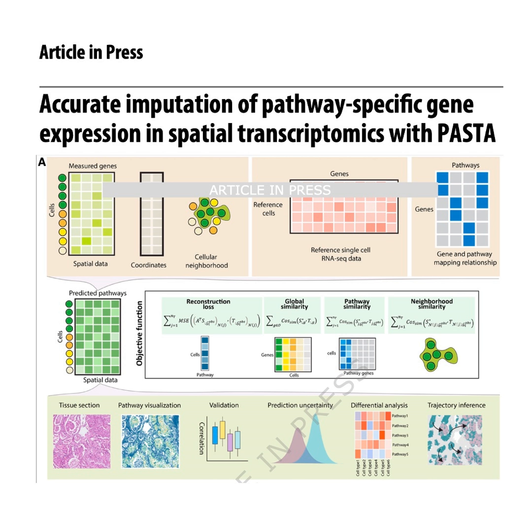I see. And finally, the fourth coach, the neighborhood similarity check. This is one more layer of spatial quality control. It encourages the model to produce these cell-type coherent expression patterns by looking at how similar the pathway expression is in the immediate surrounding cellular neighborhood. So all 4 coaches work together. Exactly. Combined, they ensure the final predicted pathway expression is accurate, stable, and biologically informed because it's blending cell identity with physical location.